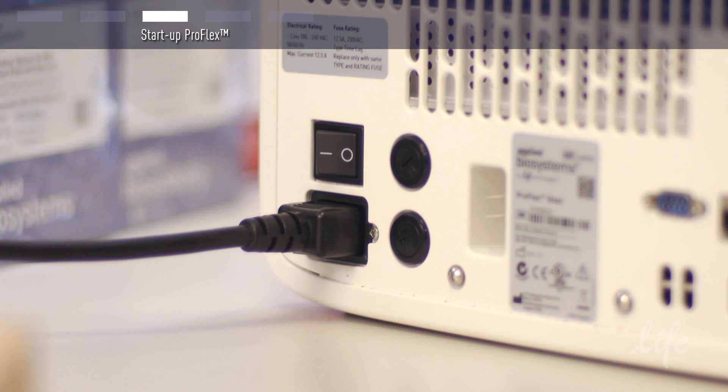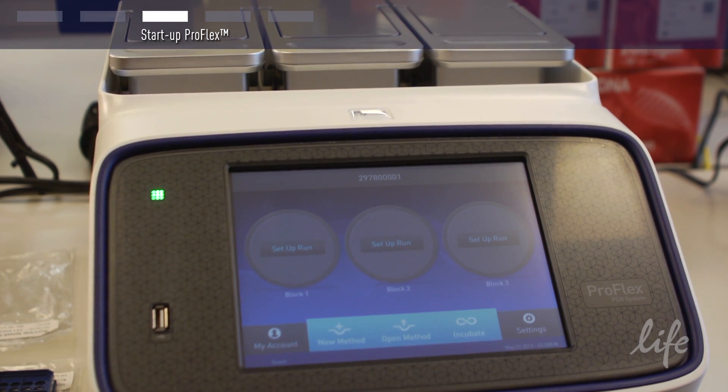Turn on your ProFlex by using the switch around the right side in the back of the block. The start screen will display.